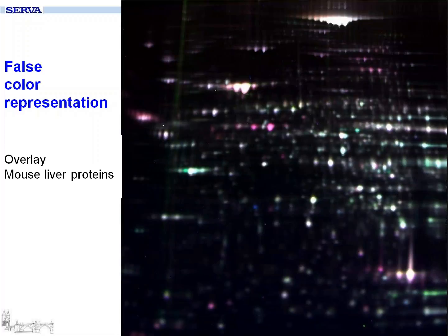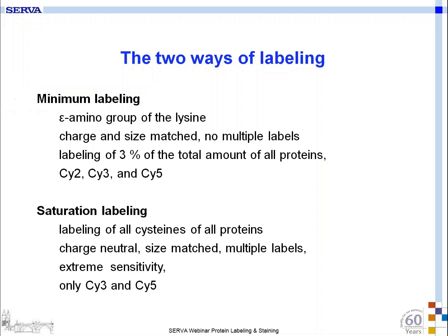That means that a green spot would be overexpressed in, let's say, your untreated sample, and after treatment, the spot would be overexpressed here as a red spot. You can therefore improve your protein electrophoresis a lot, and you get much more information than from a single SDS-PAGE, of course.